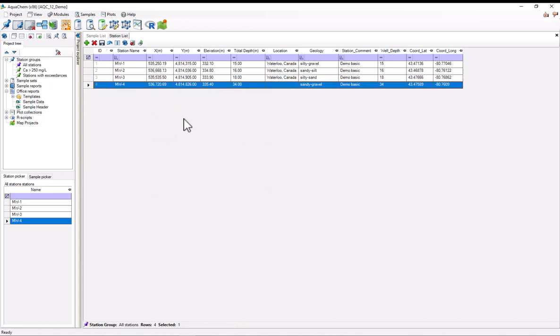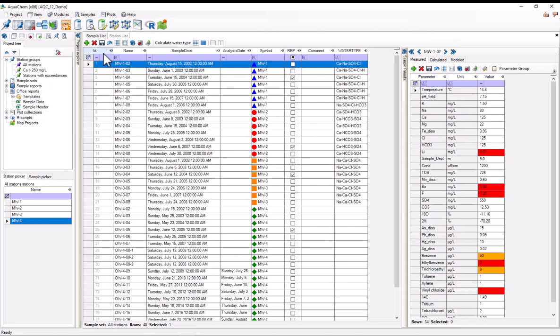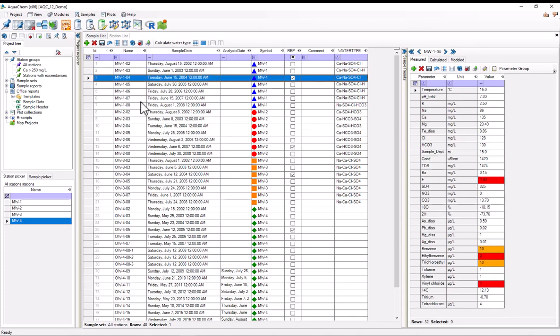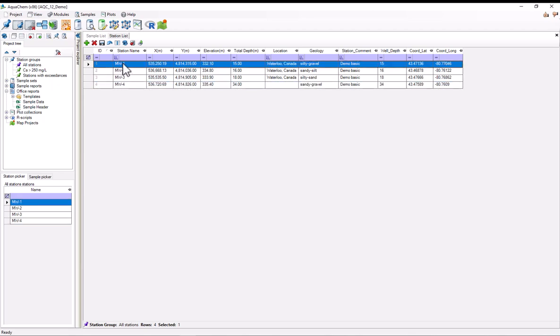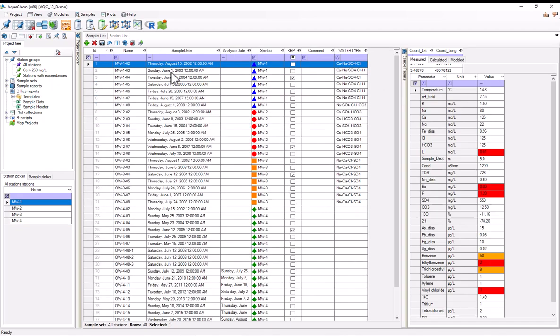In addition, AquaChem is something called a relational database. So these tables can have relationships with other tables. A good example is that on the sample list, each one of these samples, even though there's not a field for it, is associated with a station. So like this MW104 sample is associated with the MW1 station.